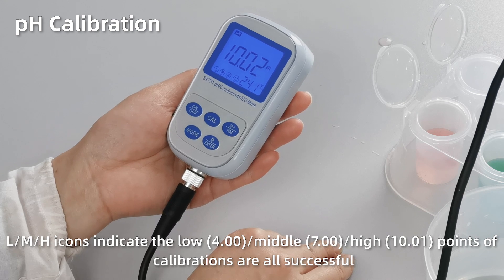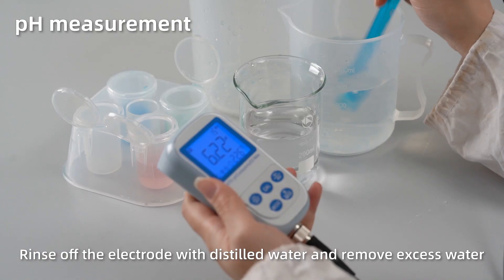The L, M, H icons at the bottom left indicate the three points of calibration are all successful. pH measurement.